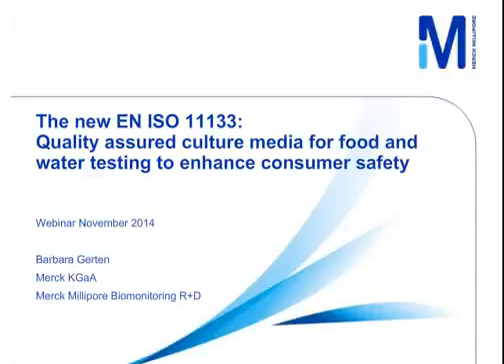So the subject today is we will talk about the new EN ISO 11133. This is a new standard which had been updated and released in May this year. So it is a brand new update, and the objective of the webinar today is we hope that you will better understand after the webinar that the EN ISO 11133 is an important quality guideline for the preparation and performance of culture media for microbiology testing. And of course we hope that you will better understand the content of the new ISO version.